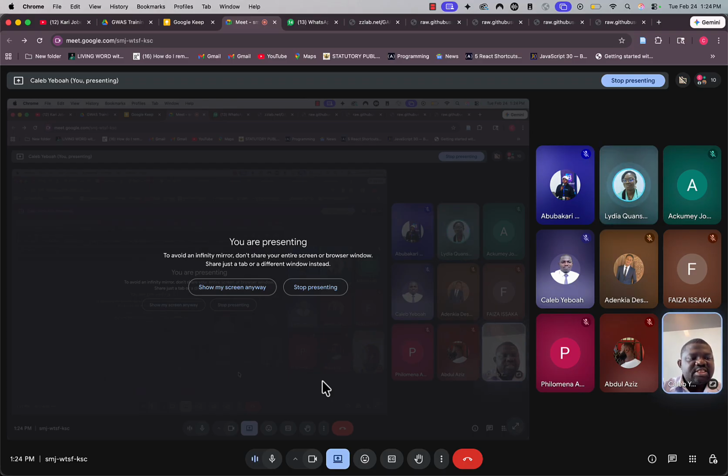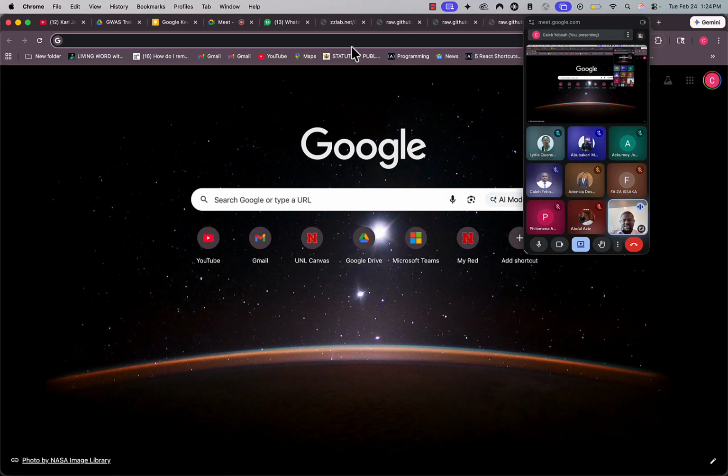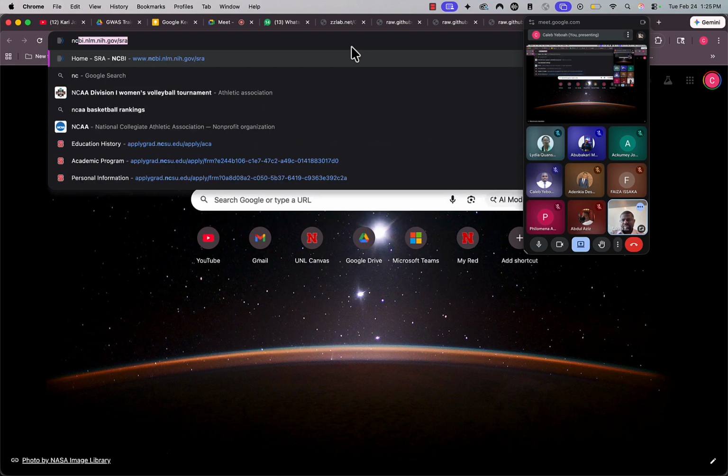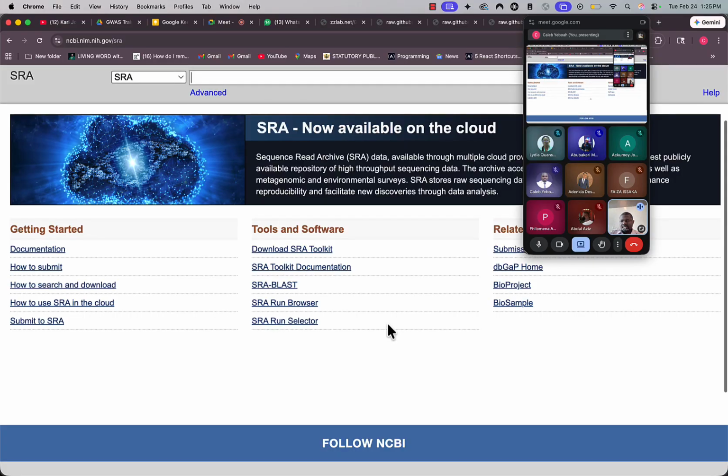If you don't have access to the genome, usually what people do is to look for the genome. Let me just share this resource with you guys. NCBI.